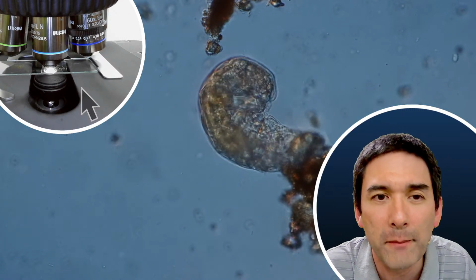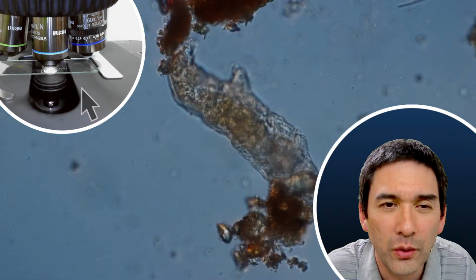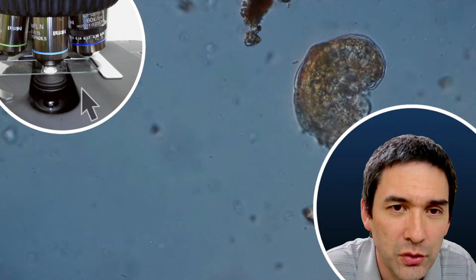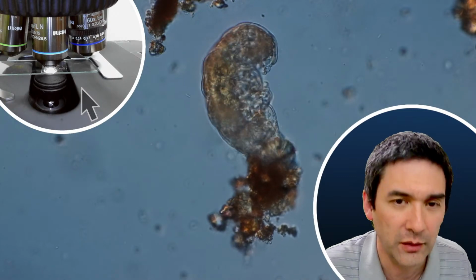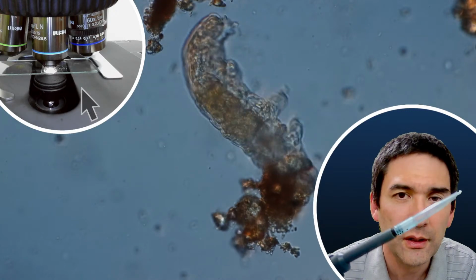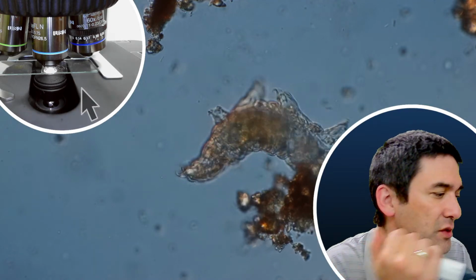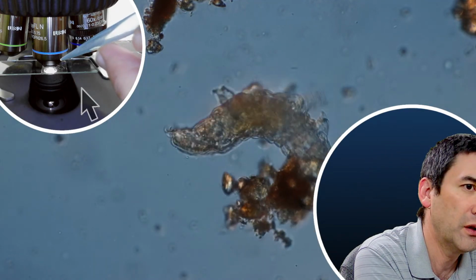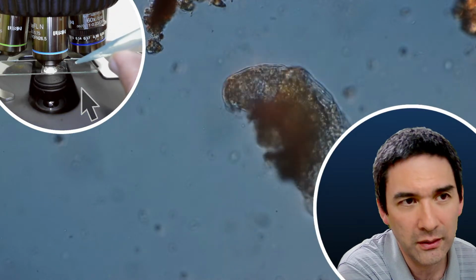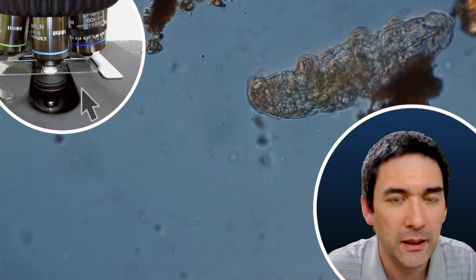You're talking about so-called micro manipulators, and essentially what is possible is if you use a microliter pipette like the one I have over here. This is a 1 milliliter pipette, but there are also smaller ones, and I think the smaller ones are maybe more suitable. And what you can do is go here on the slide, and with a second hand finger resting here, you can actually try to take up some water samples this way.